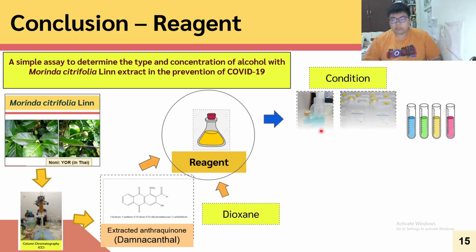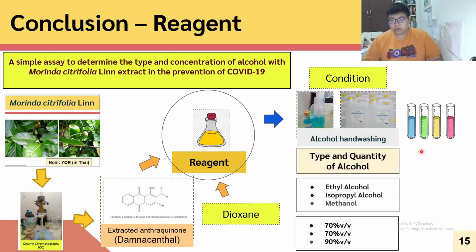However, our findings are still limited by the test range to the experimented alcohols. In the following studies, we recommend expanding the range, such as testing below 40% alcohol content and testing with more frequent intervals in between to clearly see the color gradient.